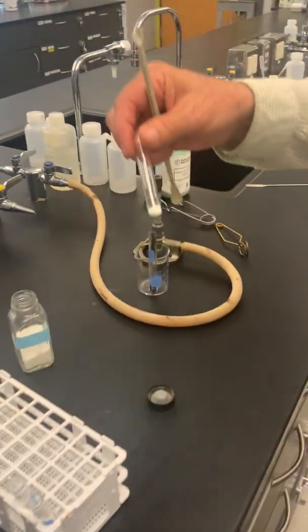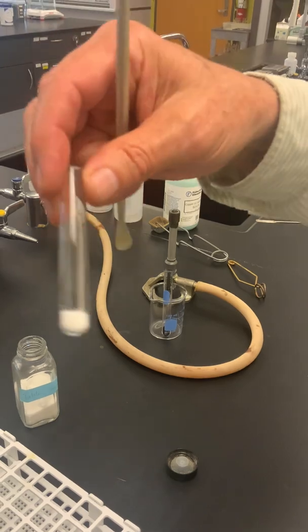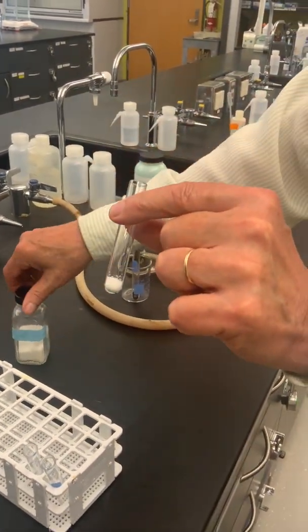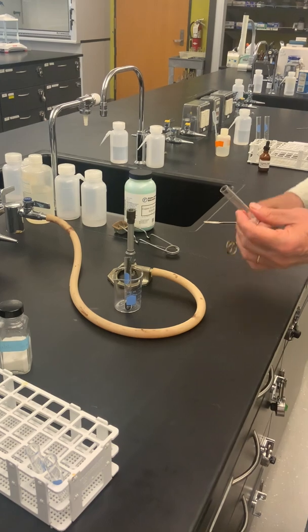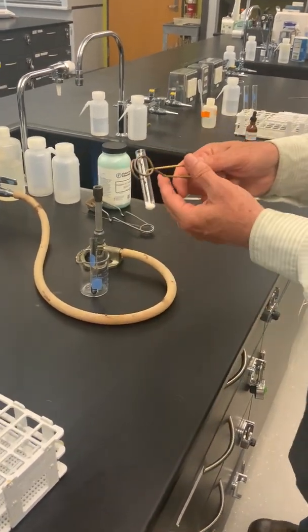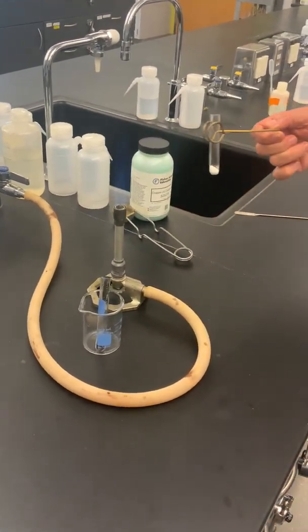Putting a small scoop of solid sucrose in our test tube. Won't spend a lot of time describing it, since most of you know what table sugar looks like. And then again, because we're trying to accomplish a decomposition reaction, oftentimes energy is required to make that happen rapidly.